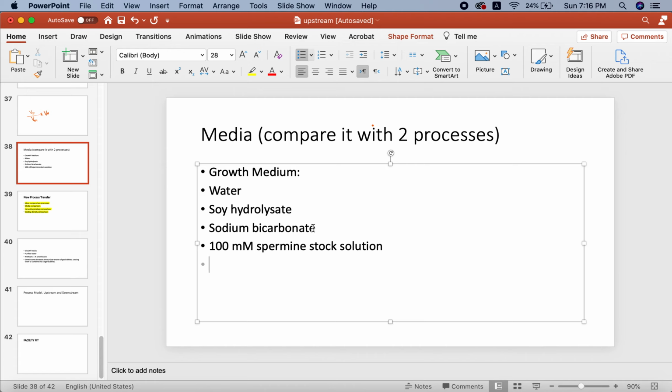The process seed density for this step should be determined as part of process development and will be molecule specific. Starting the perfusion on day 1 and/or increasing the perfusion rate sooner needs to be considered depending on the specific requirements of the cell line. The target seed density in production should be determined from the performance.